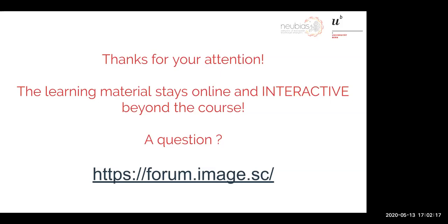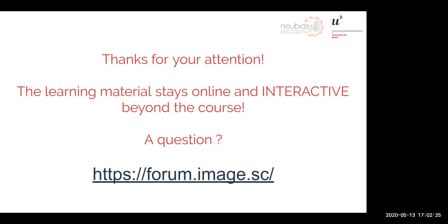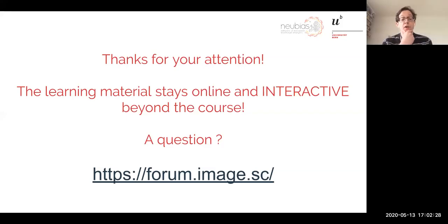There is a question regarding Stardist and cellpose, whether the training data sets are available somewhere. I used essentially what is provided by the developers. For Stardist, they have, I think, two or three training examples. One was trained on nuclear examples, also from this Broad repository, like 500, 600 images of different types. This is available in their GitHub repository. And they have also, I think, synthetic data. So essentially, I used that.